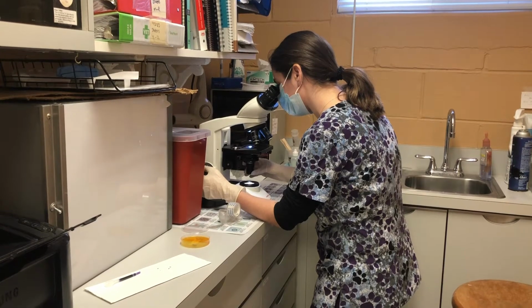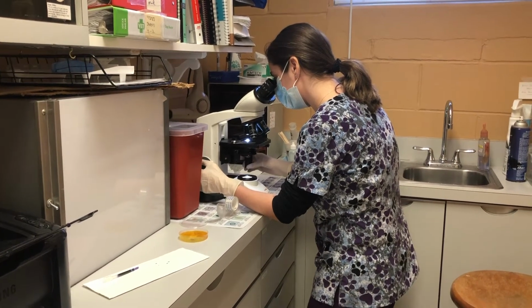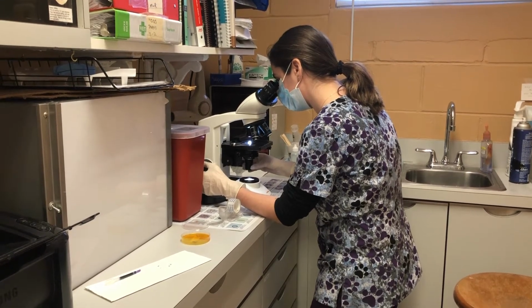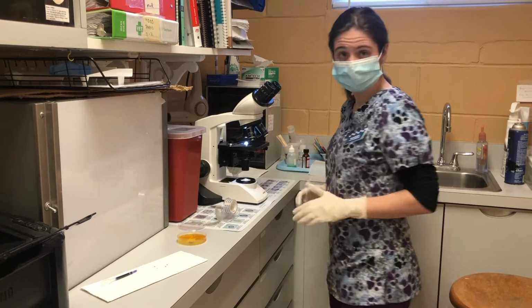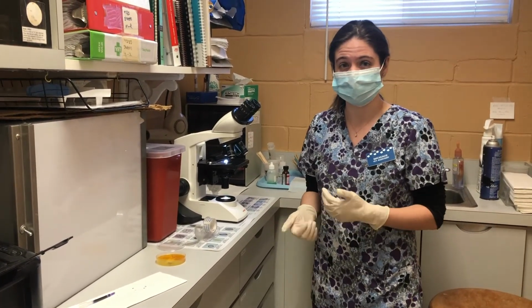So far, nothing. Yes, so this sample is negative for dermatophyte spores, so we would consider this culture negative.